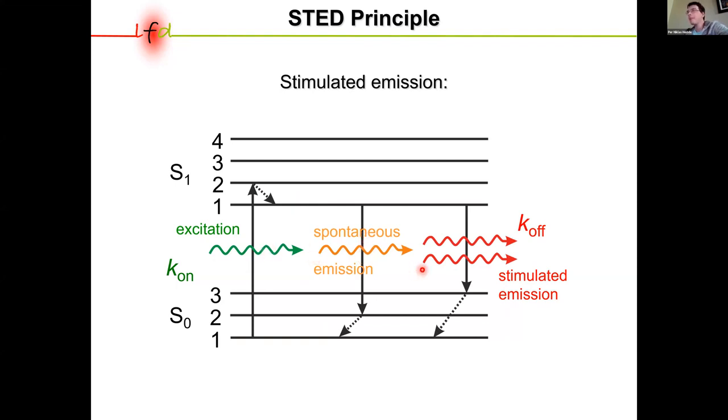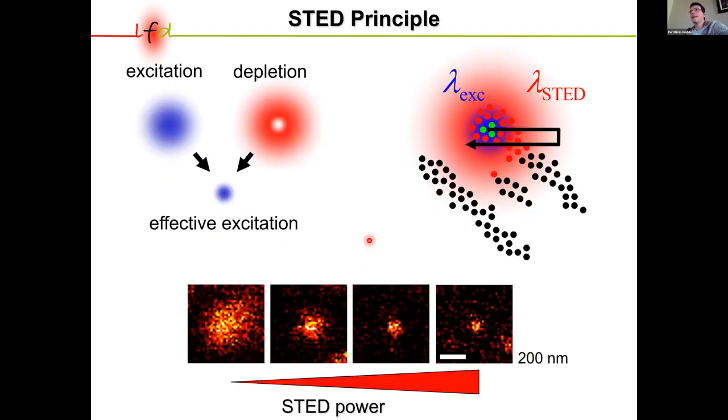excitation spectrum. Now, alternatively, if while the molecule is in the excited state, you hit it with a photon that's within the emission range, you can induce the release of the fluorescence photon, which is called stimulated emission. Otherwise, you just have to wait, and after some time, which is the fluorescence lifetime, it will go back to the ground state. So STED microscopy leverages this principle by overlaying the excitation spot with the depletion pattern in the form of a donut, which has zero intensity in the center.